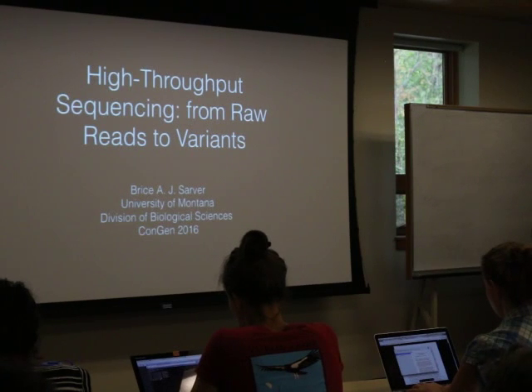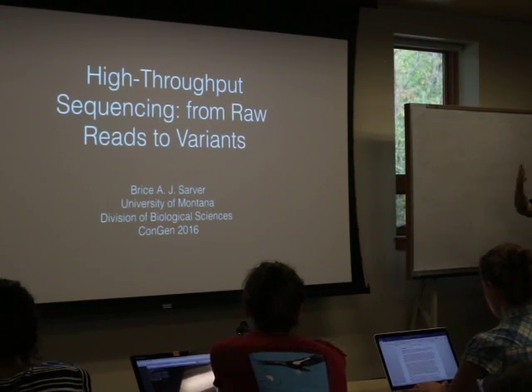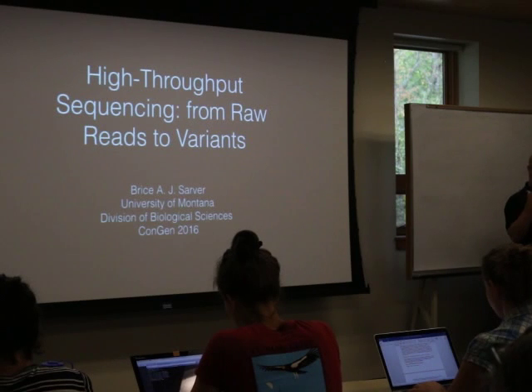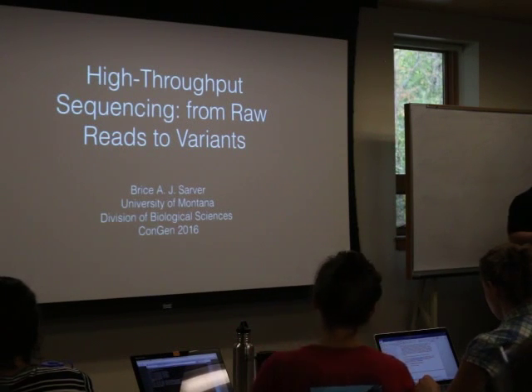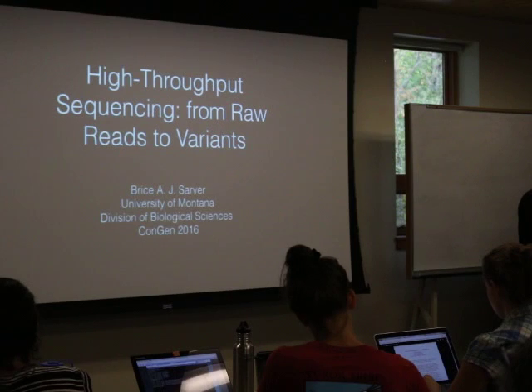to analyze data sets. So we're going to be focusing here on using high-throughput sequencing in general, taking things all the way from raw reads through variants. We actually won't be dealing with raw reads in the data set itself. Those are clean just to save time, but think about it as if you're getting your raw data off of an Illumina machine, or a sequencing core is distributing it to you or something like that.